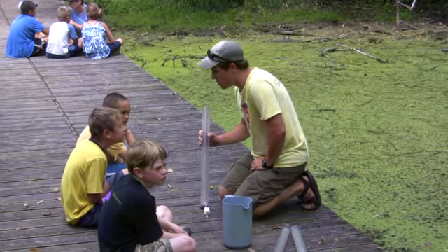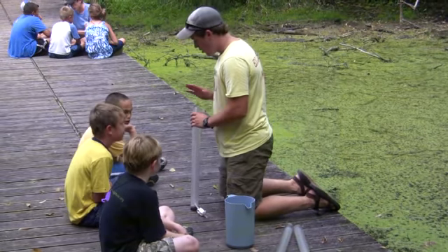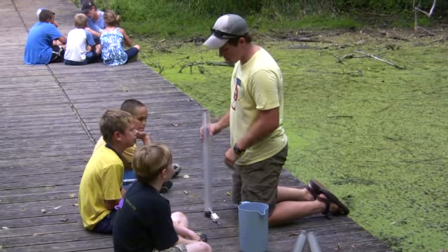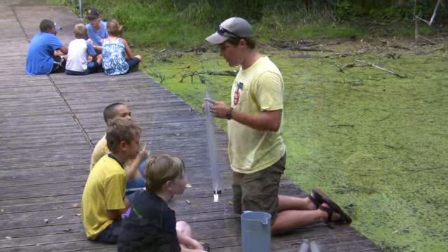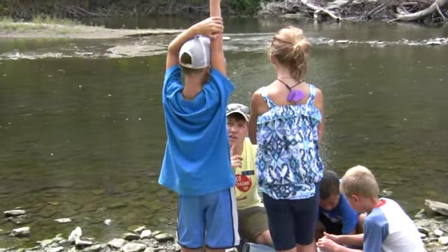Alright, so everybody will get a turn to watch it, and everybody will get a turn to do the valve, and then we'll see how the measurements compare. Alright? River. What else? Henry.